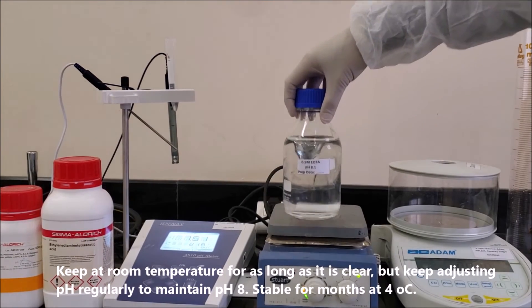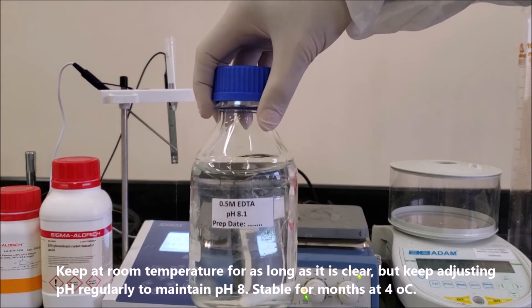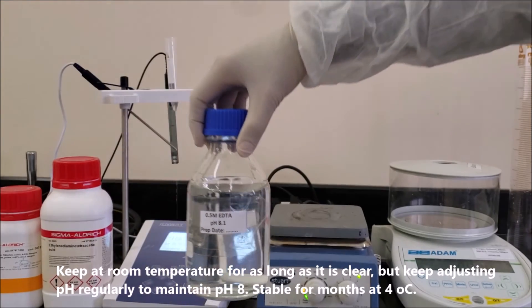Keep at room temperature for as long as the solution remains clear, but keep adjusting the pH regularly to maintain pH 8.